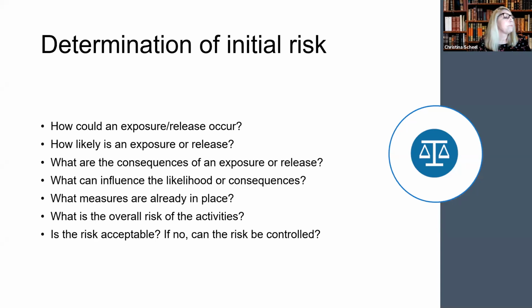An initial risk, I'm going to define that for you, and this is found in both the monograph and the LBM-4. It is risk associated with laboratory activities or procedures that are conducted in the absence of additional risk control measures. Okay, and I put in the additional because you may already have some control measures in place when you perform your initial risk assessment. So that was why I added that little word in there. But I think you'll see why when we continue.